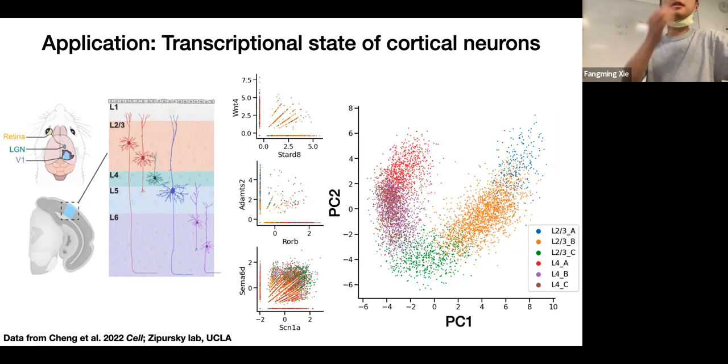So when you apply PCA, you get two matrices, corresponding to the rows and to the columns. Is this plot the one that corresponds to the rows? Good question. Each point is a cell, so I'm plotting the cell by component. What he's asking is, originally you have a cell by gene matrix, and you're actually decomposing it into cell by component and component by gene. I'm plotting the cell by component matrix after that.